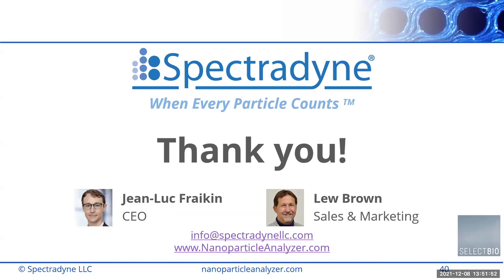That said, we measure multiple parameters of each particle event, so it's possible to imagine a longer particle that would be distinguishable from a spherical particle by its transit time, for example. It may take longer to get through the constriction.